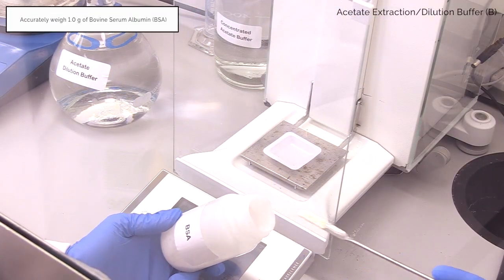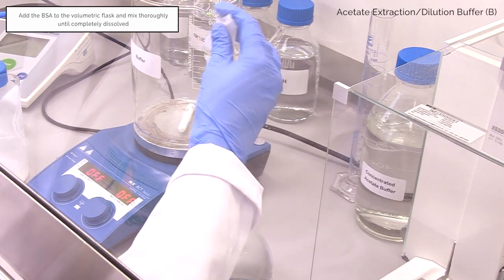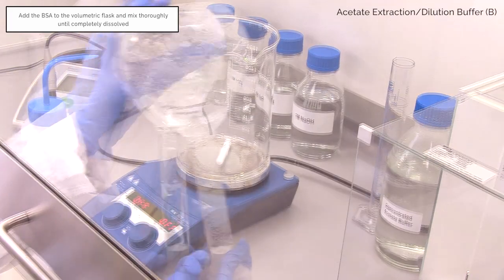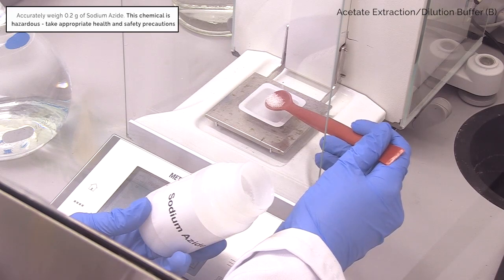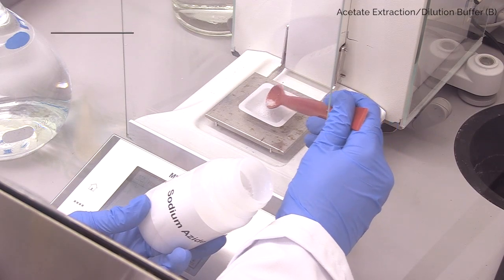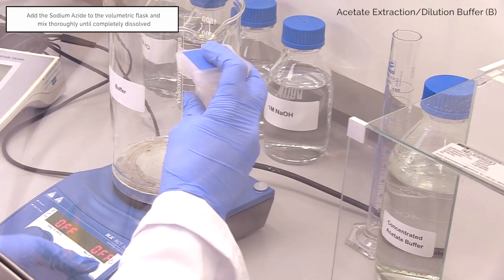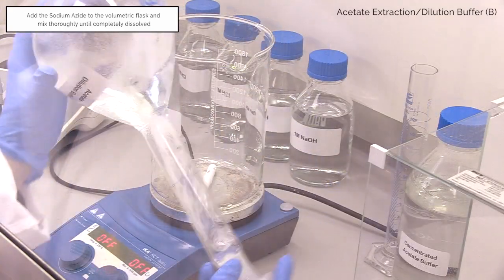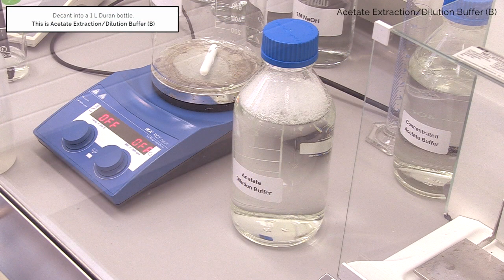Weigh out 1 gram of BSA and add to the volumetric flask. Invert to dissolve. Weigh out 0.2 grams of sodium azide and add to the volumetric flask. Invert to dissolve. Decant into a 1 litre Duran bottle. This is acetate extraction or dilution buffer B.